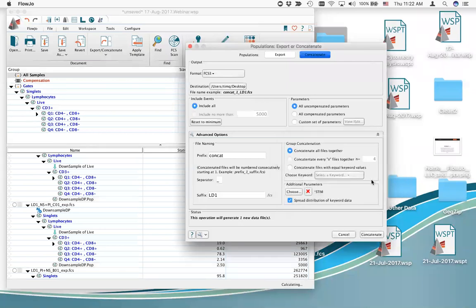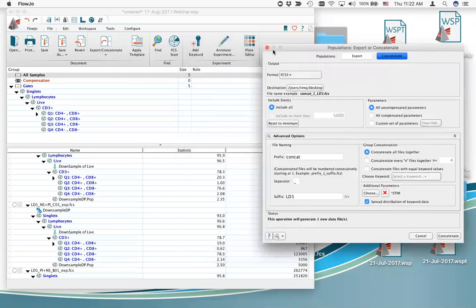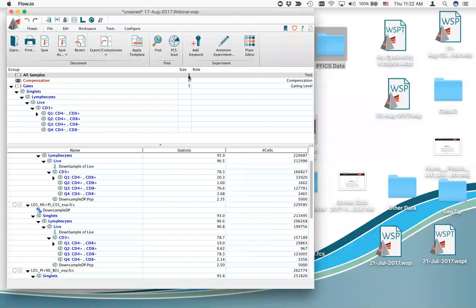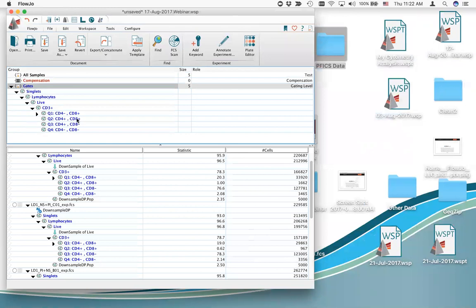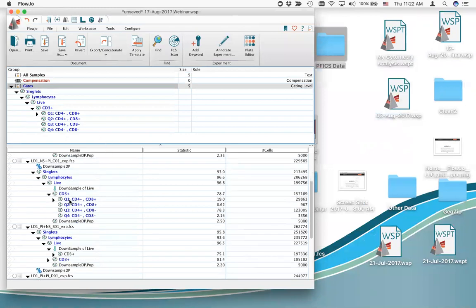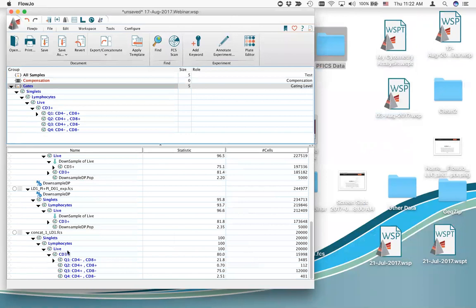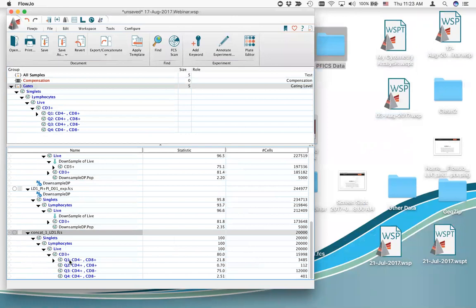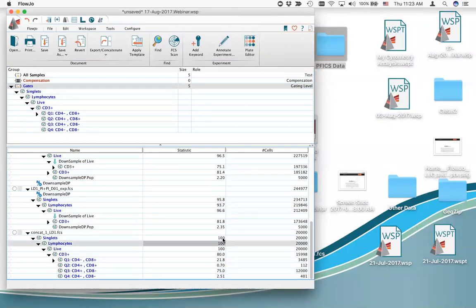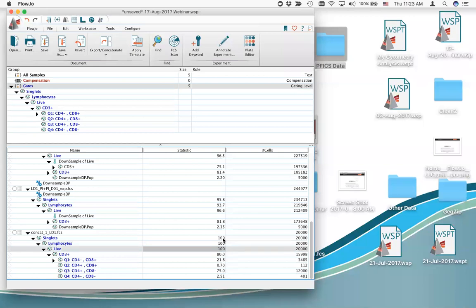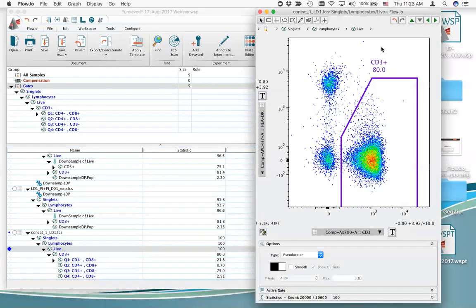I press the concatenate button, it writes the file, and I close the concatenate dialog selecting existing workspace. Now I have five files in my workspace. Because I'm using inclusion criteria for this group called 'gates,' the file gets automatically included. Concat1LD1 is my new concatenated file and it gets all of the gates. The gating frequency of parent is always 100% up through the live node because I'm only including events contained within that gating hierarchy — there are 20,000 events total.